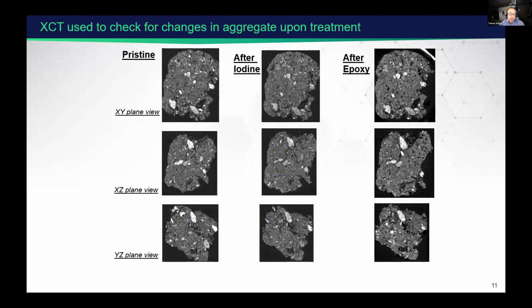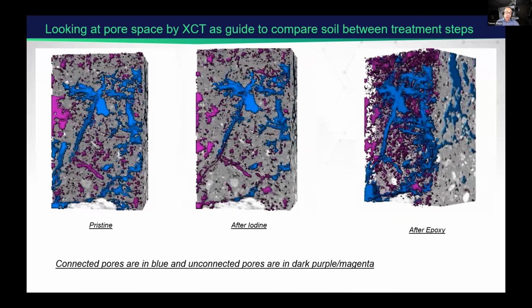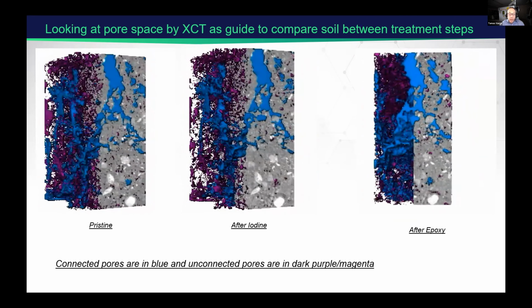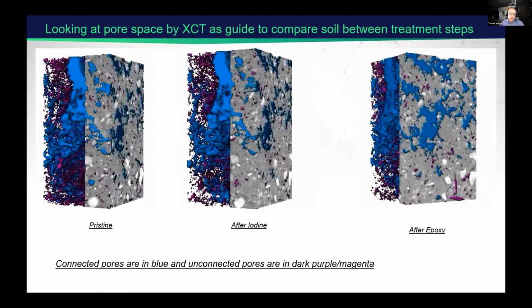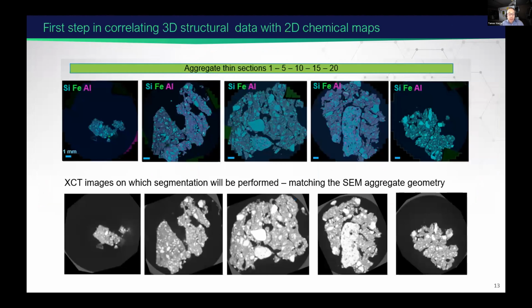And so the CT verified that we did not make significant changes to the aggregate structure. We want to study intact aggregates, so we don't want to alter them too much. We also verified that by careful segmentation of the pore scale structure in the pristine, after-iodine, and after-epoxy cases, which didn't change significantly.